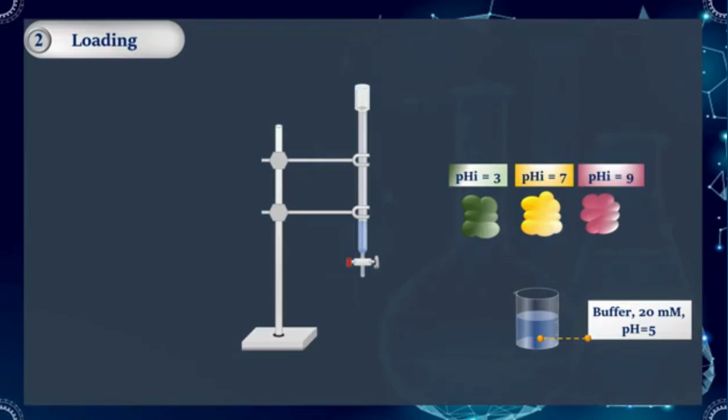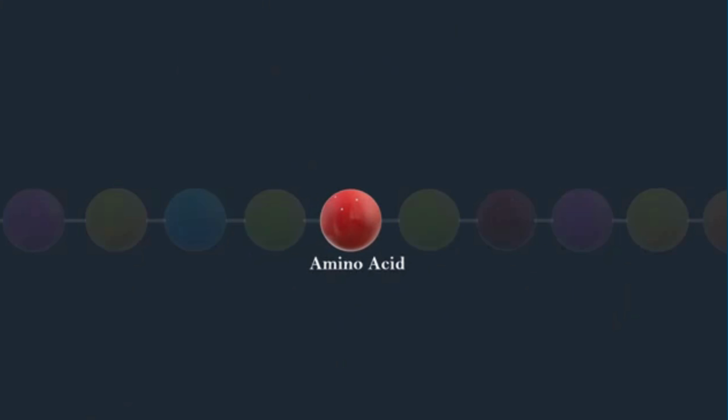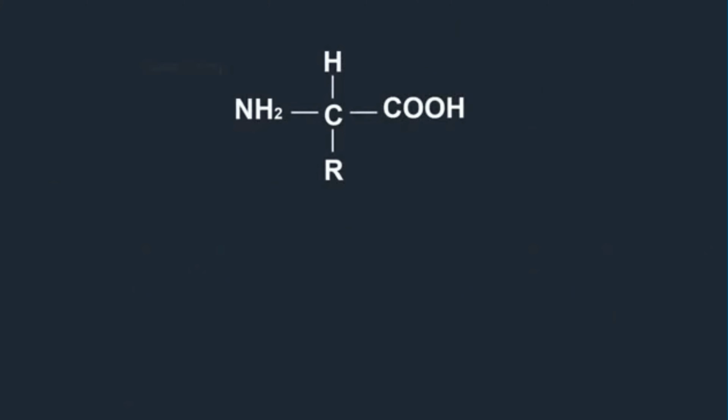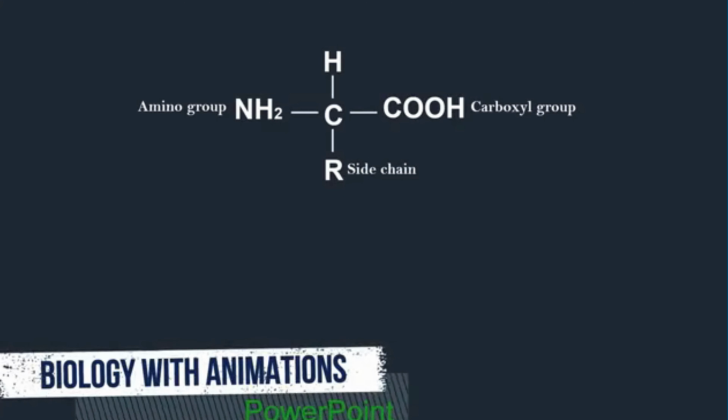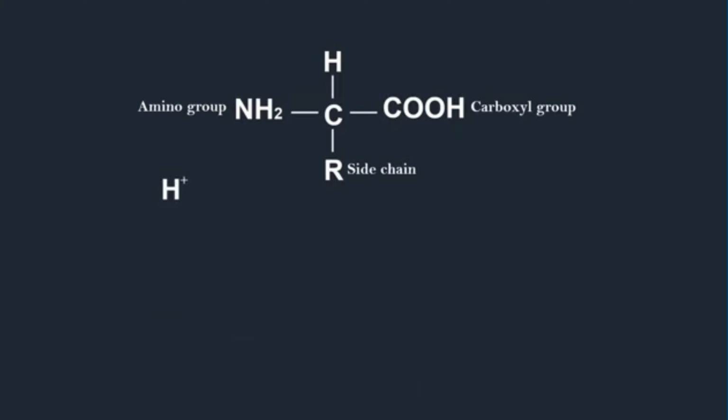Analytical chemistry: inorganic anions and cations, organic acids, pharmaceutical counterions, and trace ionic contaminants. Water treatment: removal of calcium and magnesium ions for softening, nitrate, sulfate, arsenate, perchlorate, and other ionic contaminants.